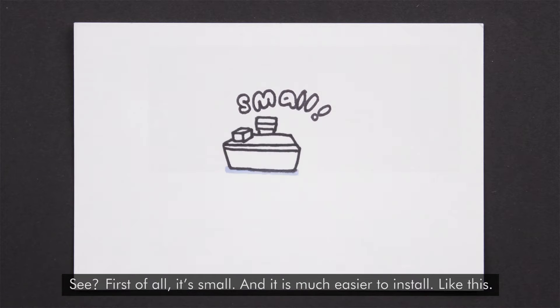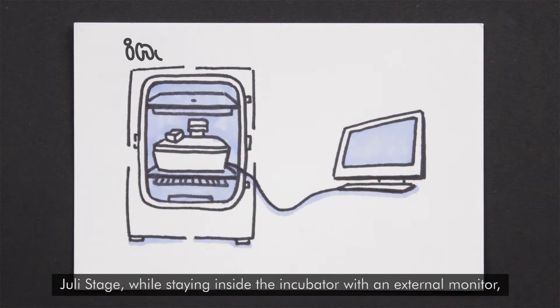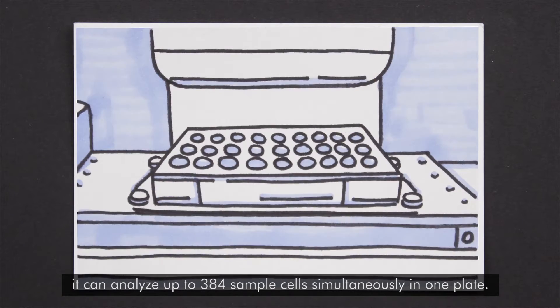First of all, it's small and it's much easier to install, like this. Julie Stage, while staying inside the incubator with an external monitor, it can analyze up to 384 samples simultaneously in one plate.